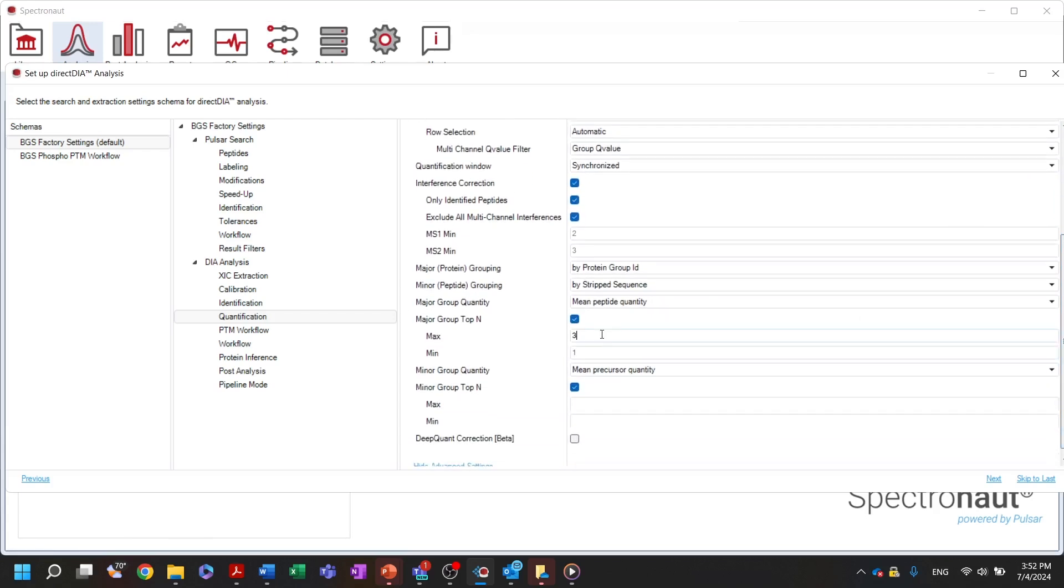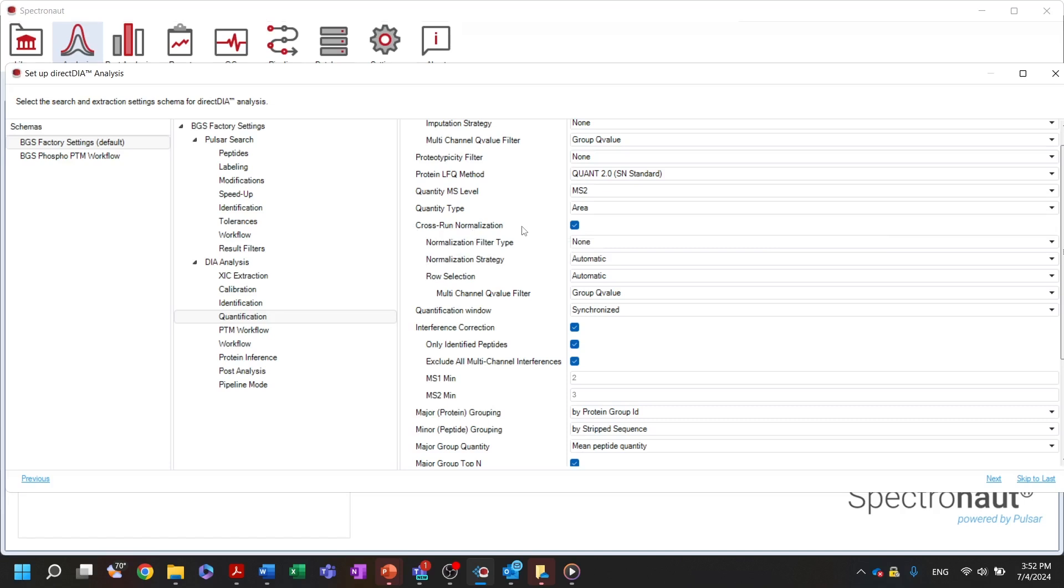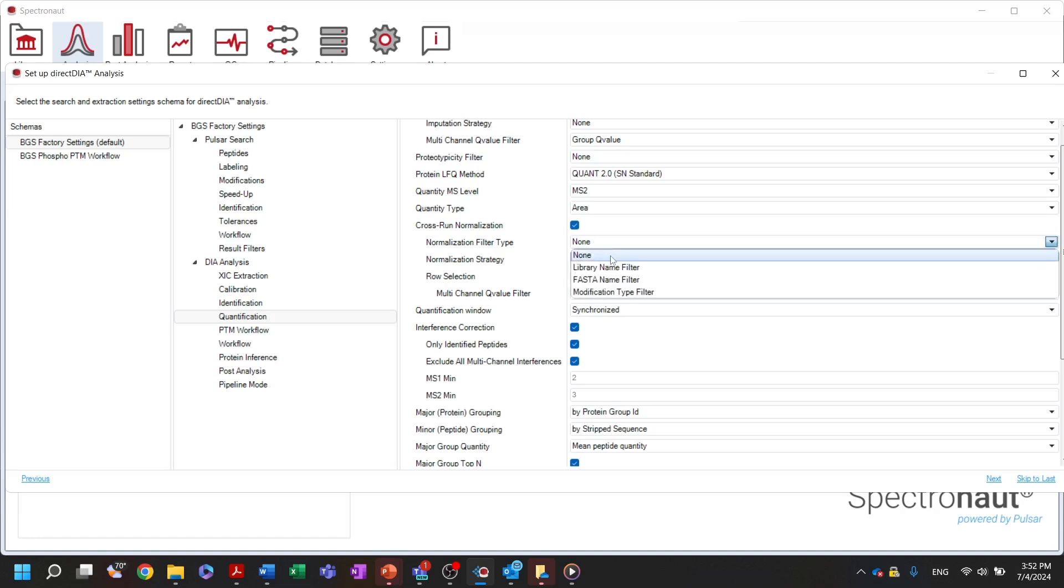Further below, you can find settings related to the normalization applied within the software. Spectronaut performs cross-run normalization on the precursor level. By default, it will select random precursors from your samples. But you can choose precursors that belong to a given FASTA file, or precursors that carry specific modification. The latter might be particularly useful in the case of PTM enrichment analysis.